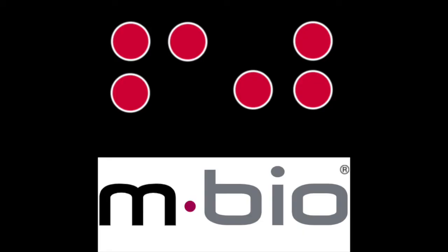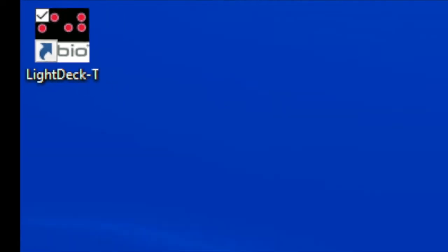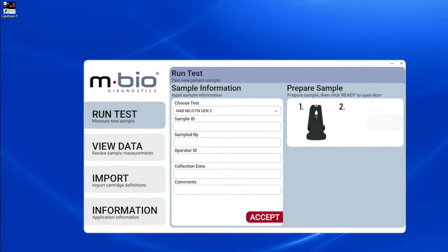Prior to preparing your sample, install the LightDeck T software. The logo will look like so. Further instructions for how to do this are in the manuals provided in the cartridge kit. Once downloaded, open the LightDeck T application.